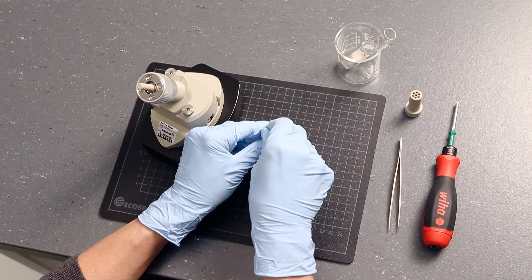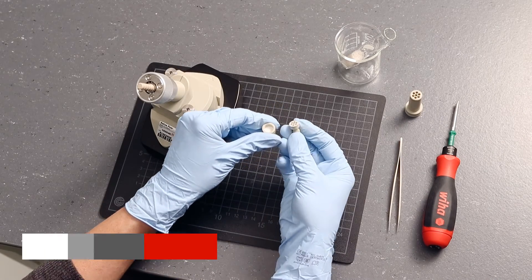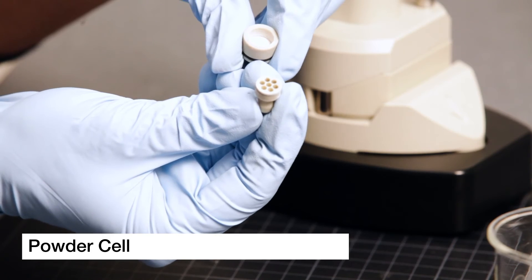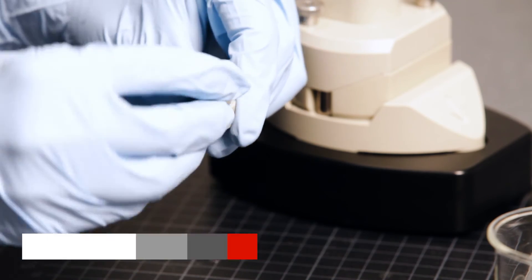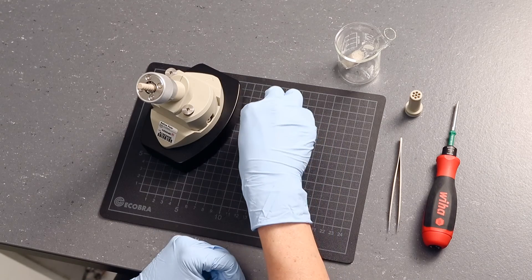Alternatively, if you want to measure small amounts of powders or powders with a minimum particle size of 25 micrometers, you can use the powder cell.